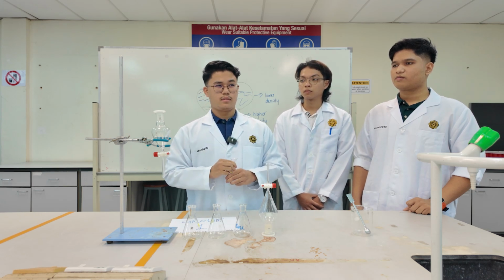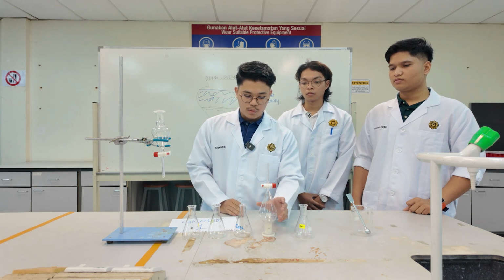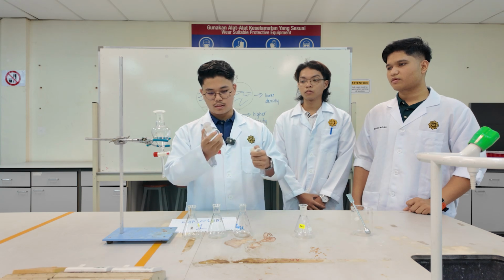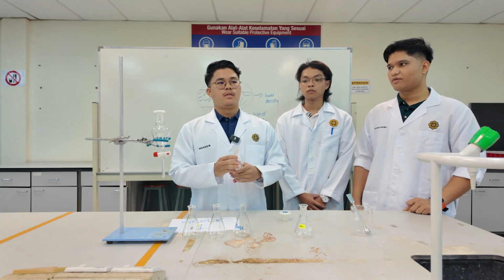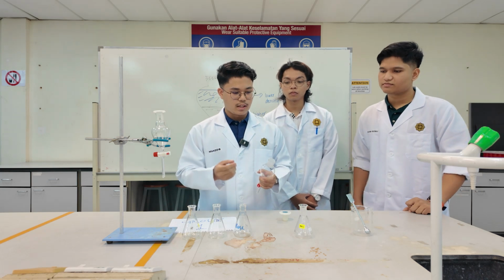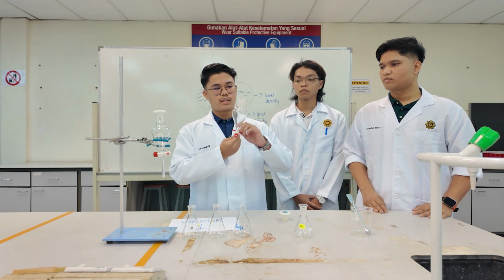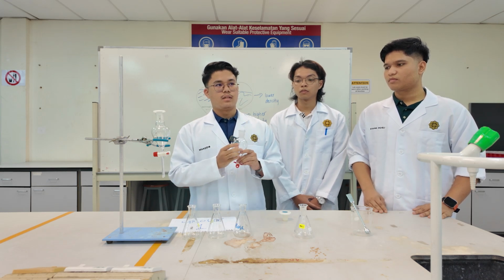And after that, we put the mixture in the separatory funnel. After that, what we need to do is extract the acid in the mixture.